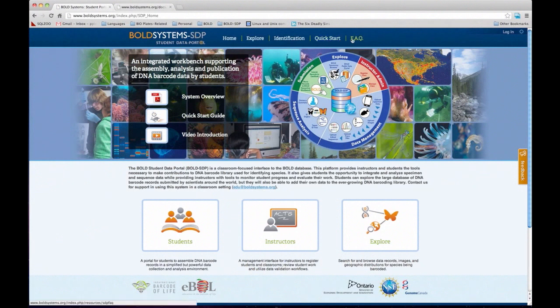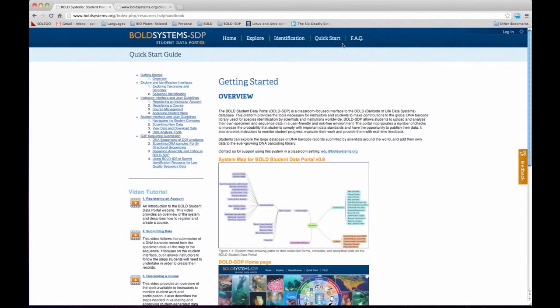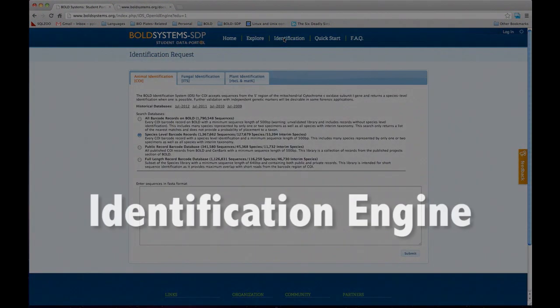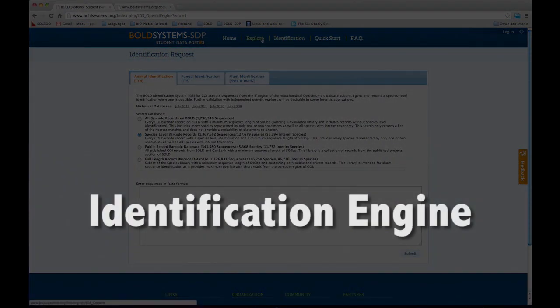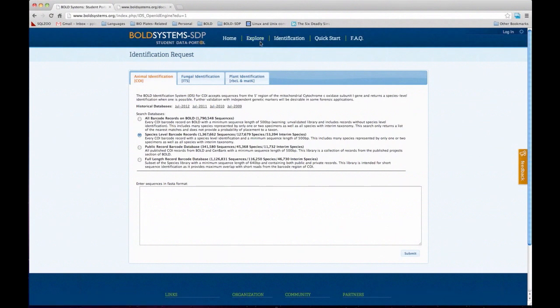Then there is the information on the toolbar. We have FAQs — these are basically the most common questions for students and instructors, separated into those two groups. The student part has some biological significance to these questions, but it's mainly associated with the system. There's also a link to the quick start guide. Then we get into analysis tools — the identification and explore tools are available to anyone, and you don't have to be logged in to use them. The identification engine is associated with the Bold library — if you add a sequence in there, it will compare your sequence to the whole Bold library. It's sort of a BLAST situation.